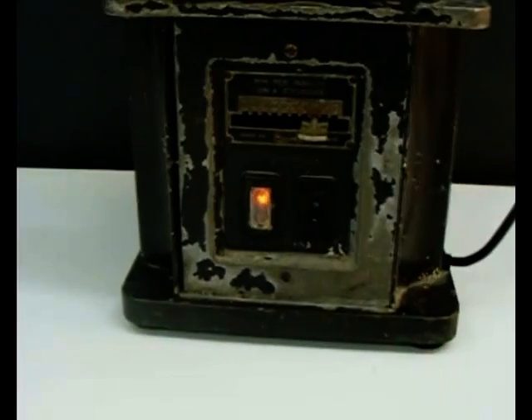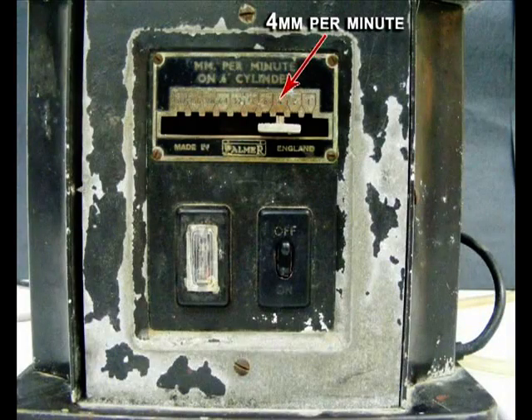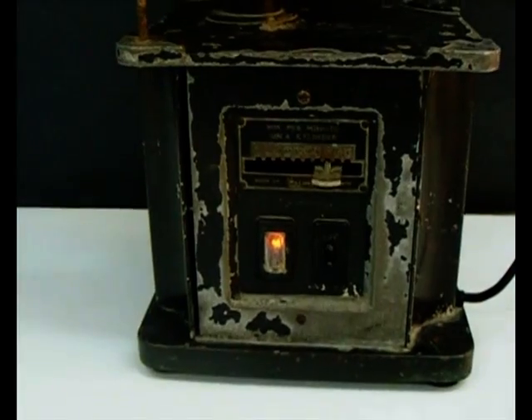In a typical experiment, the speed control switch is set to 4mm per minute.